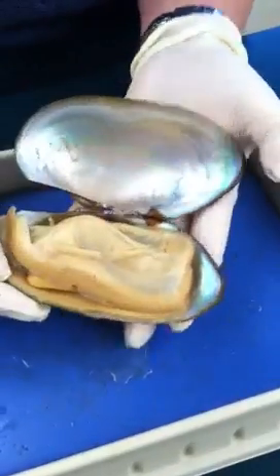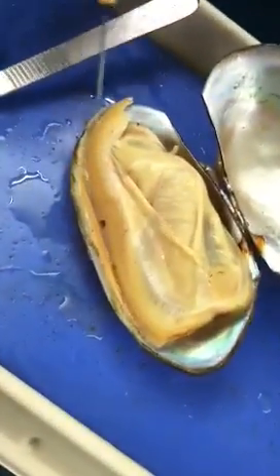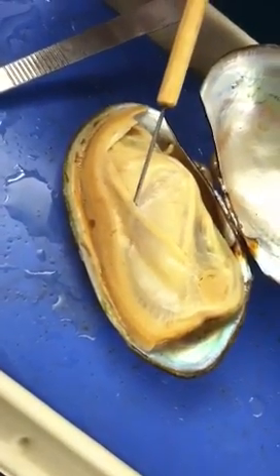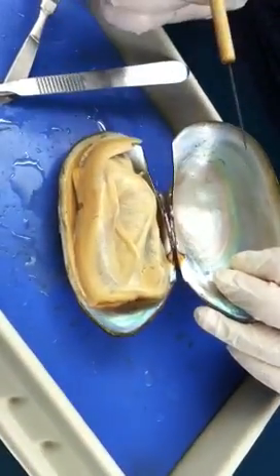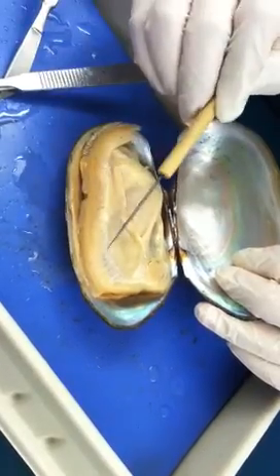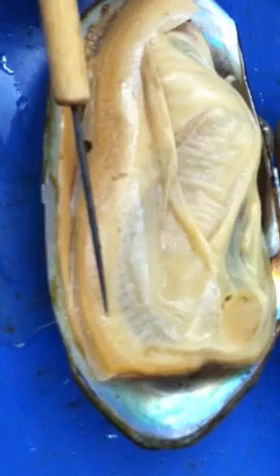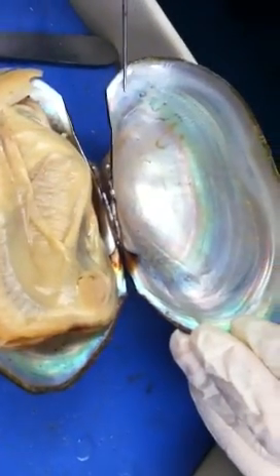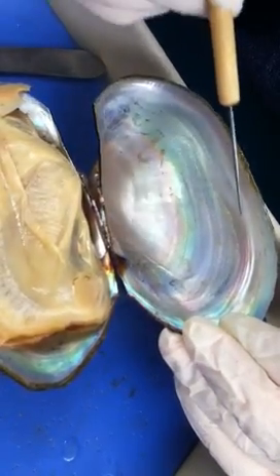Now let's move into the internal structure. The first thing you need to identify is a very thin film called the mantle — this is where the shell originates from, as the mantle secretes chemicals to produce the shell. The outer layer is actually a muscle called the pallial muscle, and it makes up an imprint on the shell that we call the pallial line.